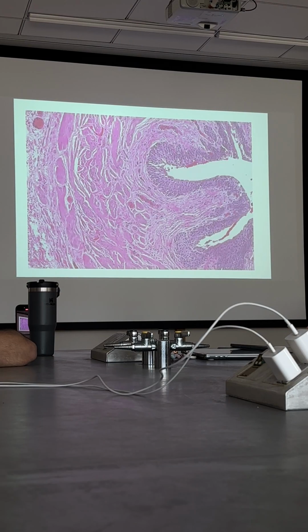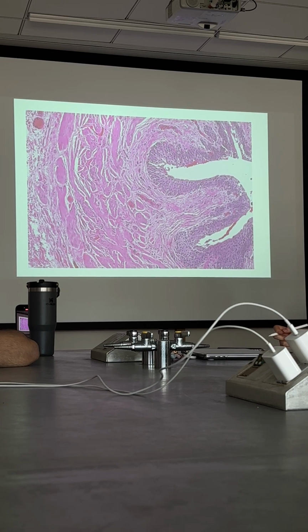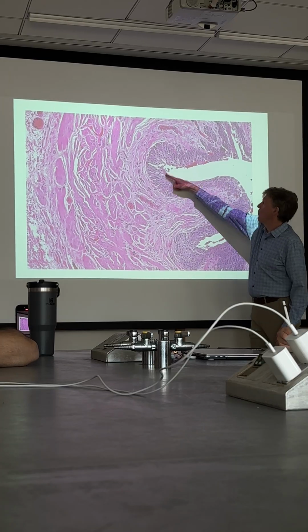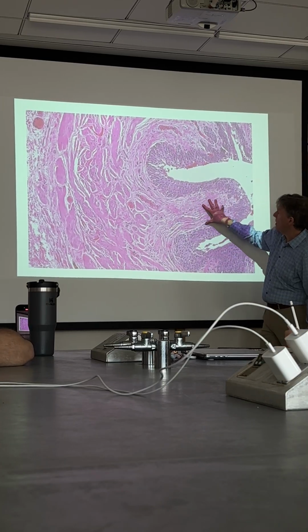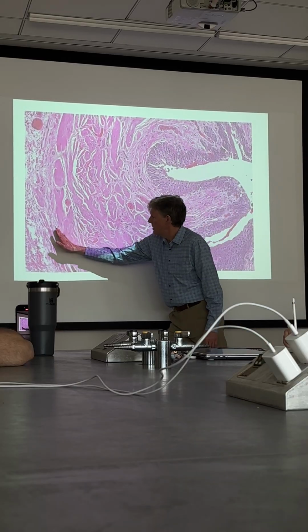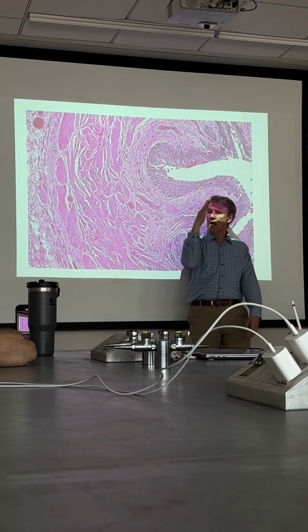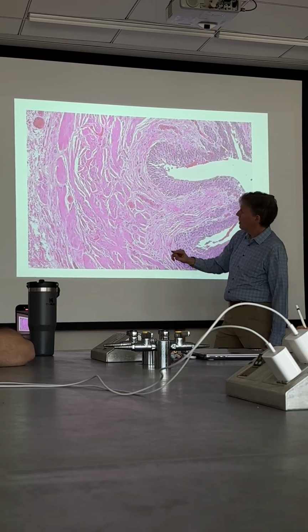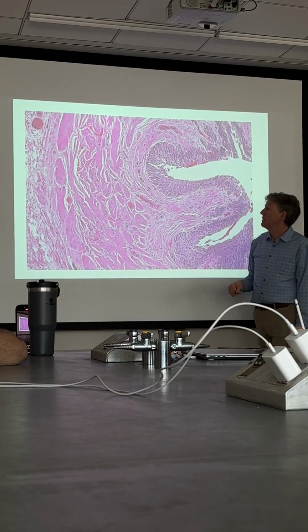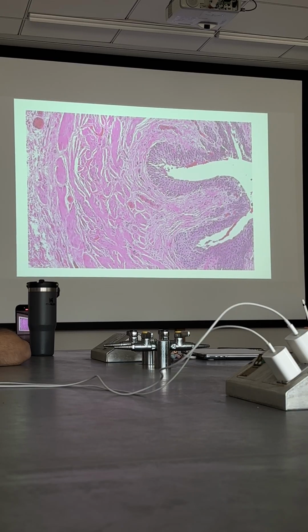All right. One more with a little bit more detail here. And you can kind of see the difference with the muscle layers a little bit better. So this is the transitional epithelium. This would be lamina propria in here and kind of going around here or over there a little bit. And then all of the rest of this is the muscle layer. These muscles are more or less coming out towards you. They're longitudinal. Versus these guys out here, you can see they're kind of going around in a circular pattern. Okay? Just the exact opposite from the intestines or from the GI tract.